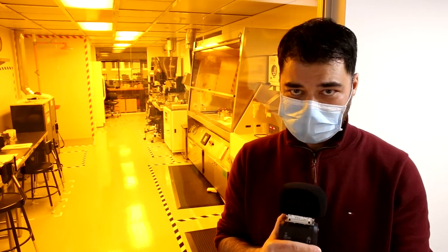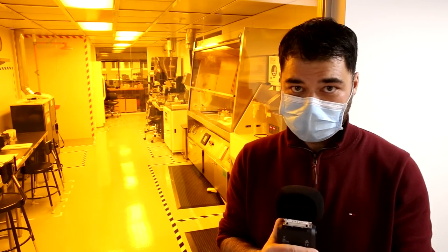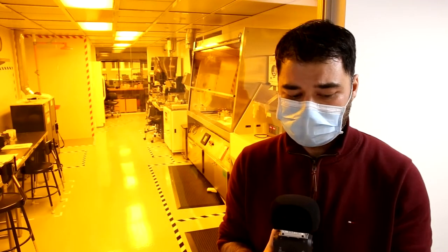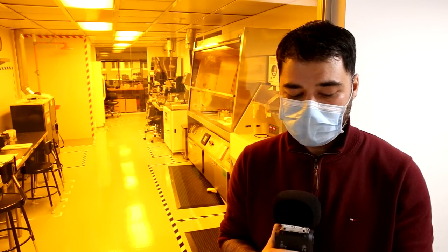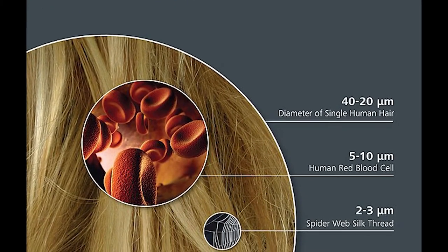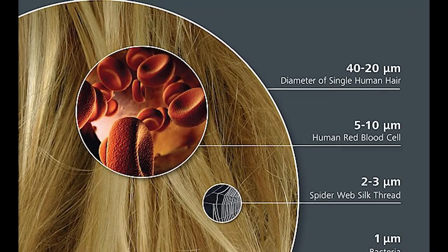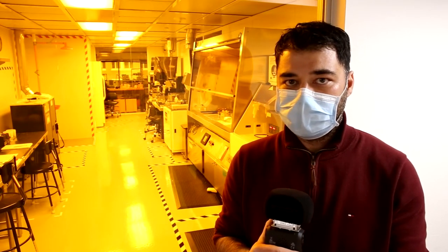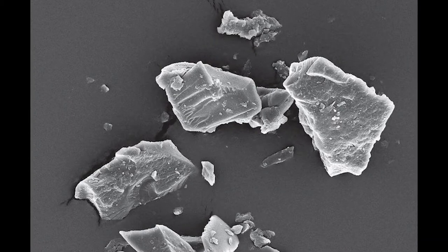So what's special about our lab, the YellowBox clean room, is the cleanliness of the entire facility regarding the air quality, which has been filtered for airborne dust particles. Our microfabricated devices are made with very tiny feature sizes on the scale of micrometers. A micron, for instance, is the scale that we normally measure things like red blood cells or bacteria or hair thickness. At this scale, tiny dust particles, which are on the same order of magnitude of our microfabricated devices with their tiny features, oftentimes have the ability to land on our devices, which basically ruins any experiment that we're doing.